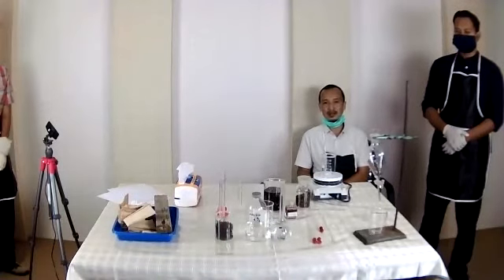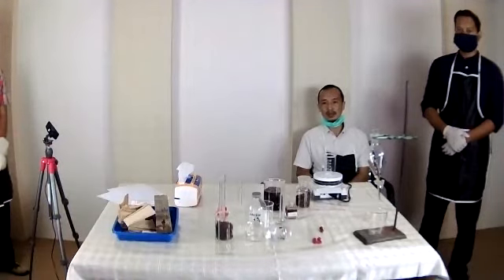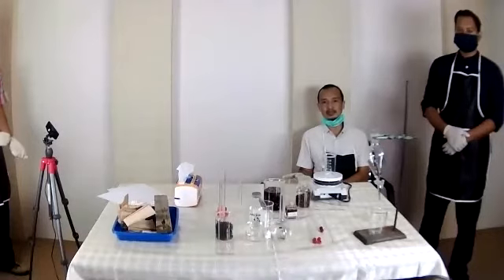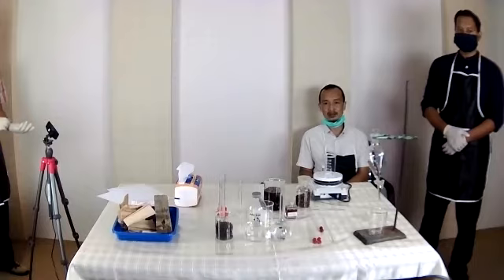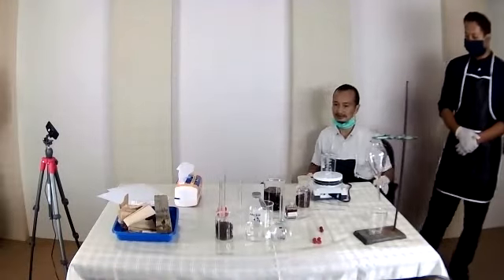And then what we're going to do today is to extract the clove, and we focus on the derivative products of the clove. So we're going to extract the oil, or the clove oil, today. So that's what we're going to learn today. Now I'm going to show you.